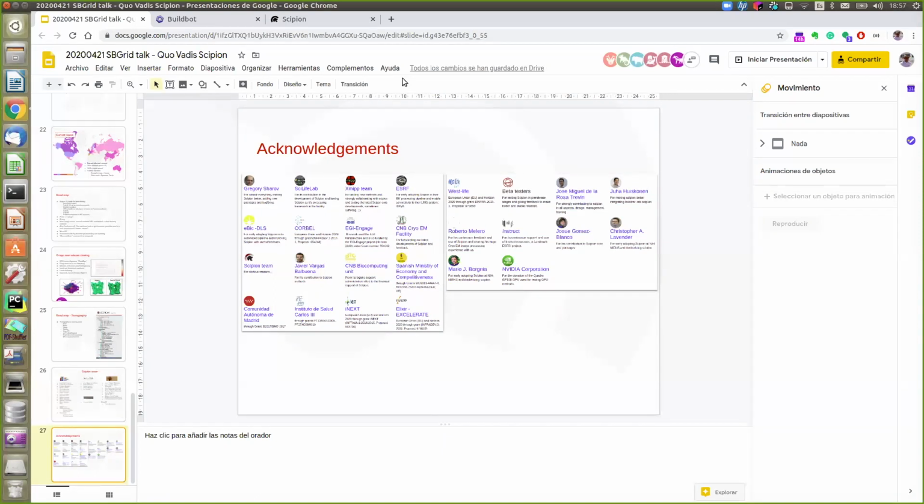Will the Scipion 3.0 databases be backward compatible with Scipion 2.0? Yes, we are always trying to keep backward compatibility, and so far we haven't detected any problem. Obviously, if you use, let's say, the Atlas plugin, for example, or some of the tomography stuff, in Scipion 3 and you add your tomography methods there, if you need to go back to Scipion 2, which is possible, you can have two installations at the same time.